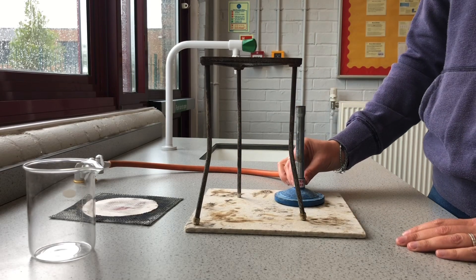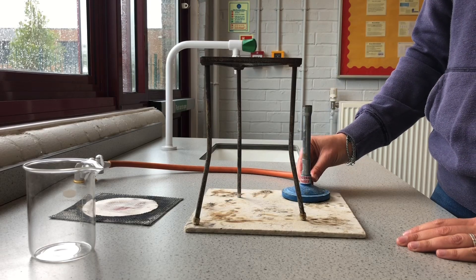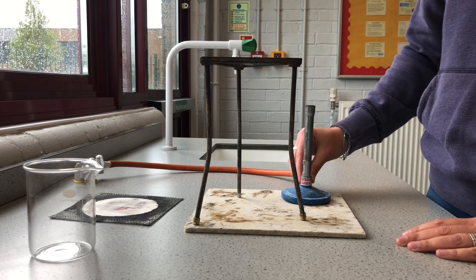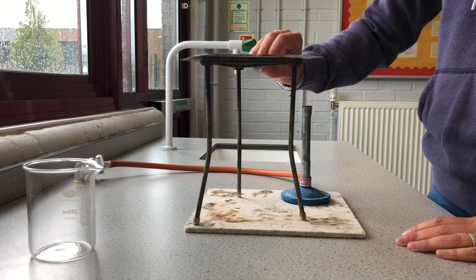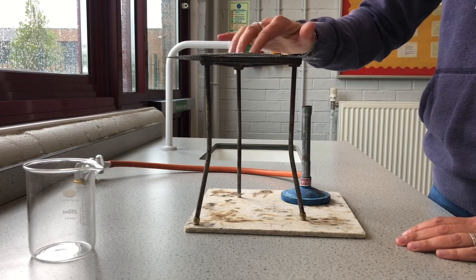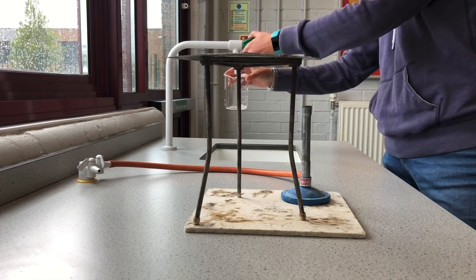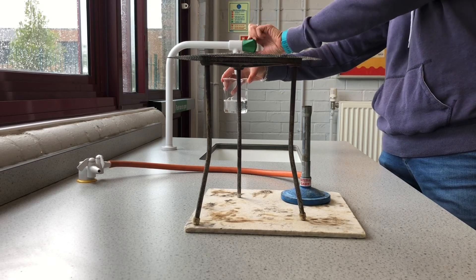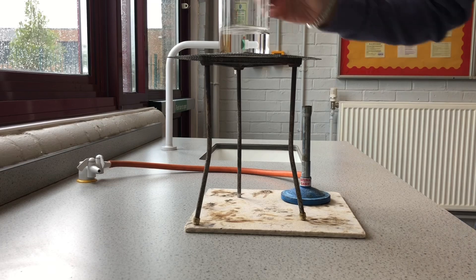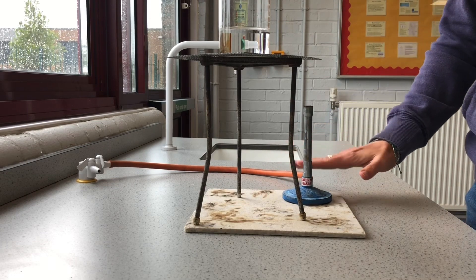I've got my Bunsen burner here and I can simply take it out without needing to put it onto the table. Then I put my gauze on top of my tripod, and I can even put my beaker on there. I'll put about 100 mils of water into my beaker and place it onto the tripod with the gauze.